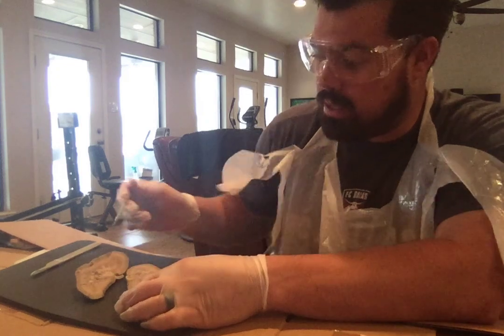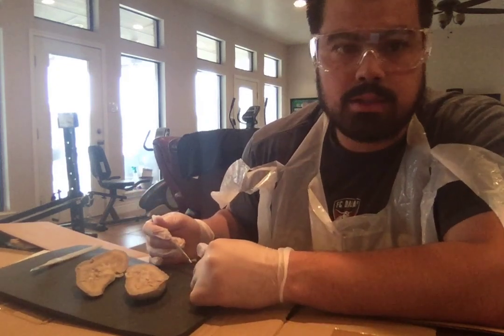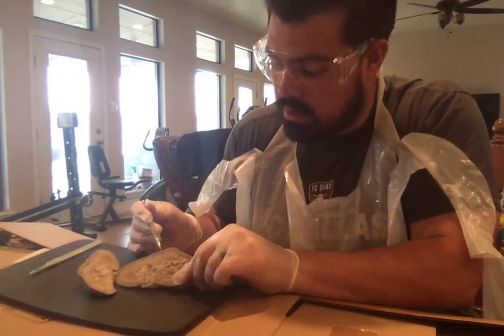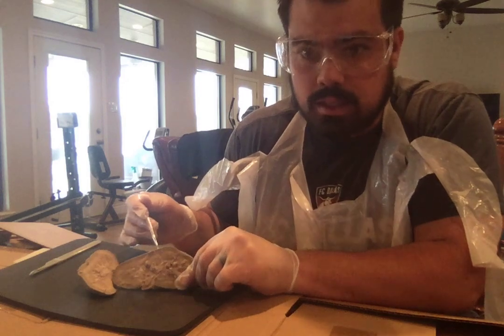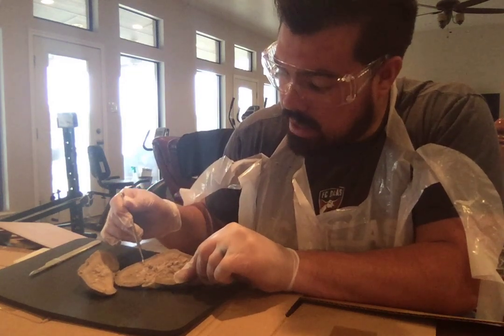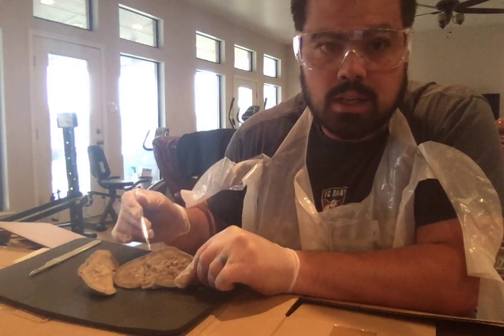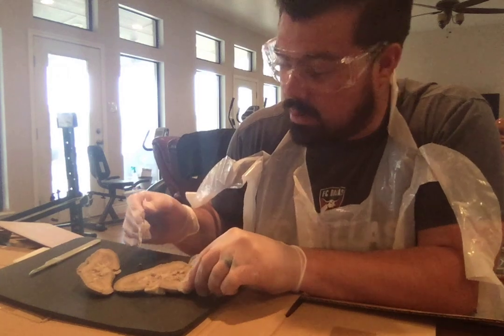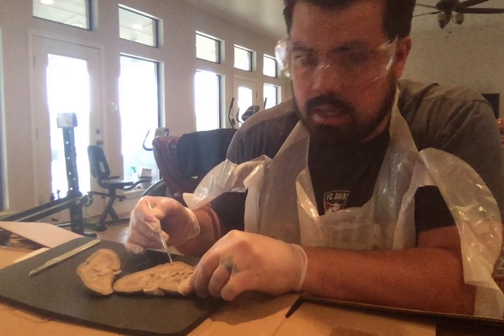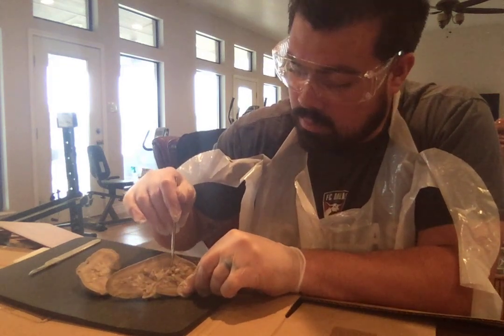As you can see, I've made that coronal cut straight down the middle, dividing it into two halves. Starting here, we've got our renal cortex, and that's a darker color. Then dividing that is our renal medulla, which is that lighter color. And right there at the base of that renal medulla, on that line with the renal cortex, are our renal pyramids.